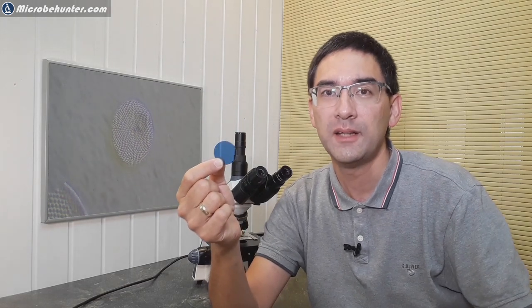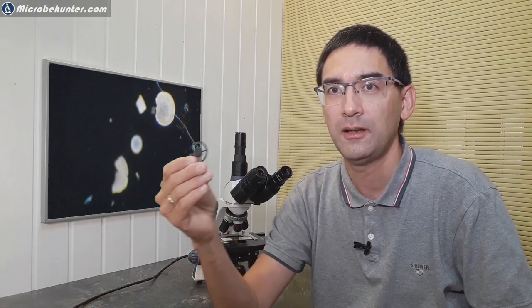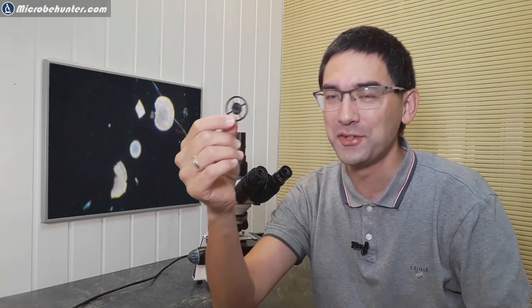Instead, many microscopes include a so-called blue filter. Here is one, but I think it's relatively unnecessary in many cases, because the blue filter is good only if you have a microscope with a halogen lamp, because the halogen lamp creates too much red light, and this can be filtered away with a blue filter. But this microscope and many other microscopes these days have LEDs anyway, so it's actually quite unnecessary. But a filter like this, they have at least up to now not included. So if you're someone watching from a microscope company, that's a big recommendation that I have, okay? So make those things and include them as well.